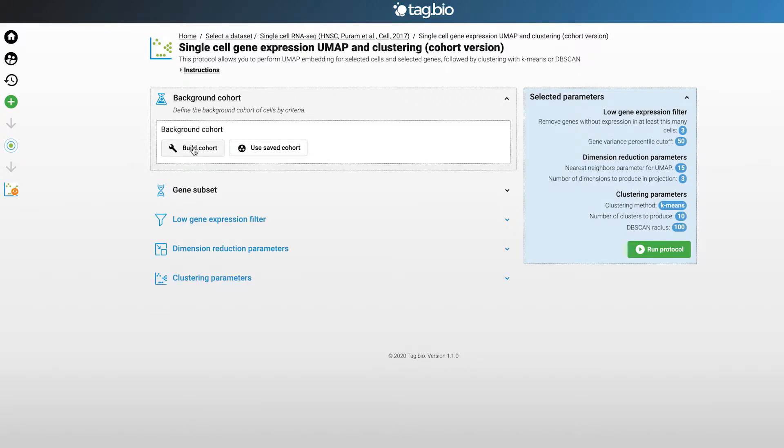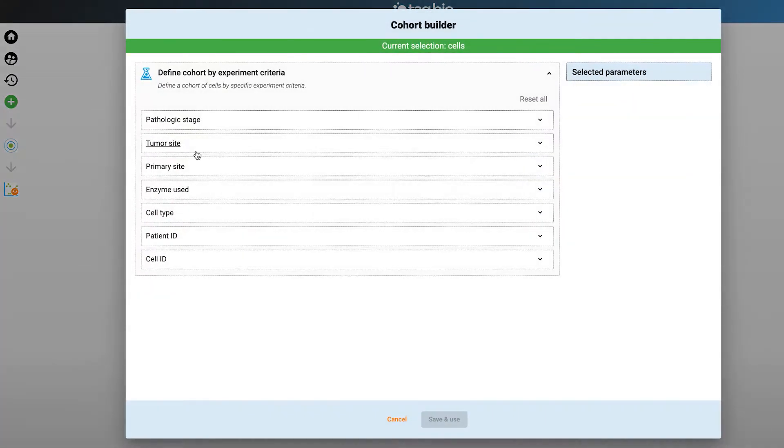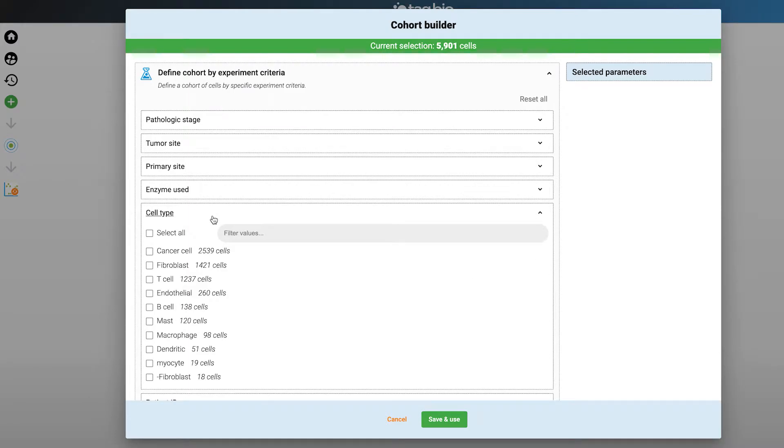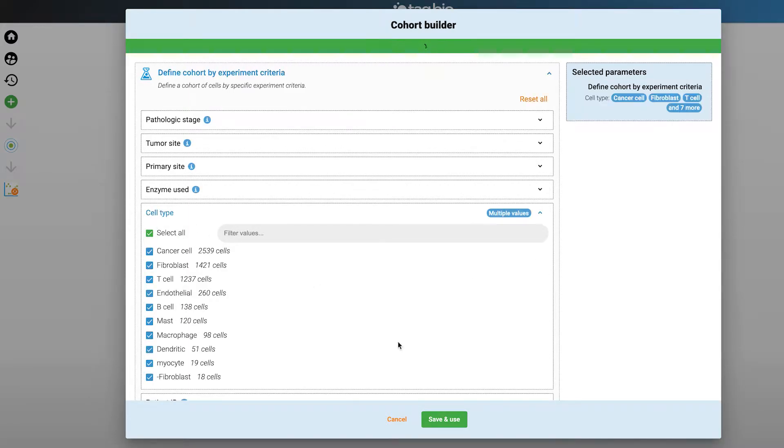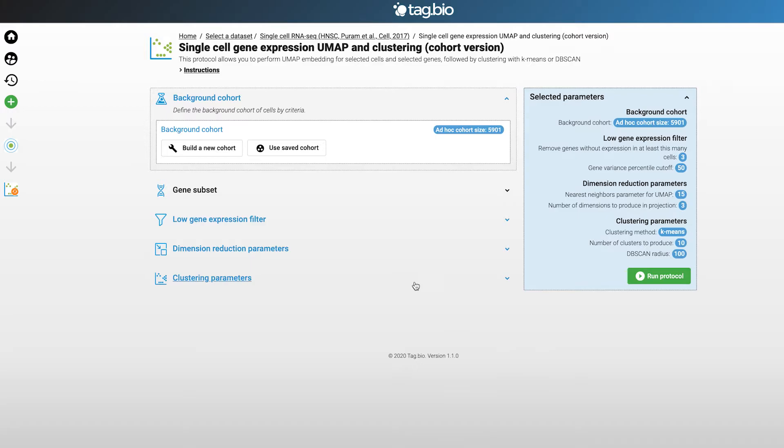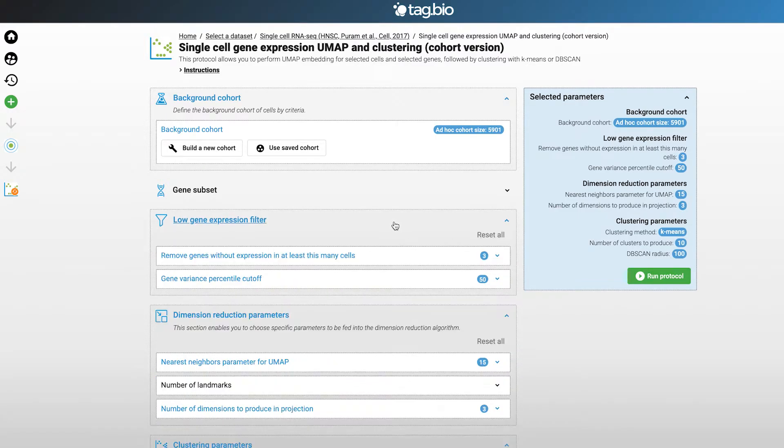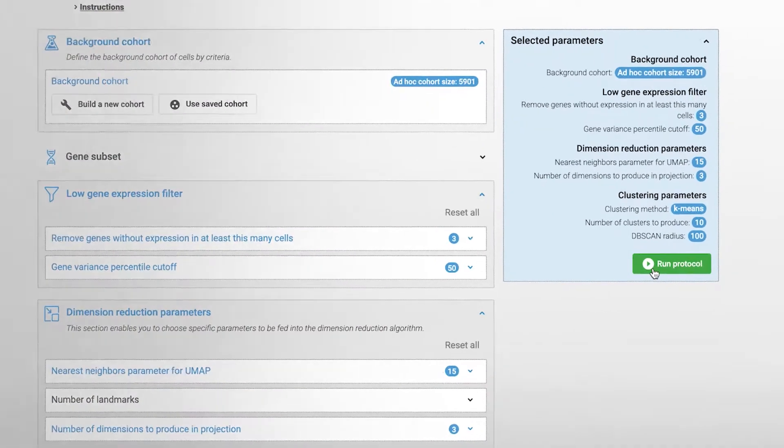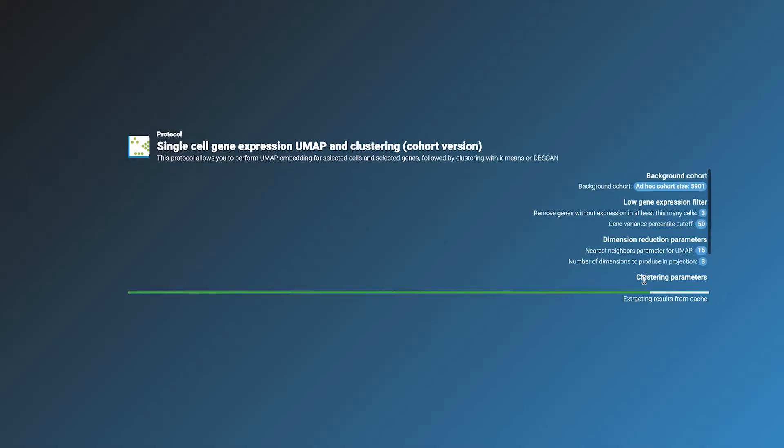In this example we will go into the cohort builder and create a cohort containing all the cell types. So we just select all cell types and click use. Then you leave the parameters in the default settings and click run to run the analysis.